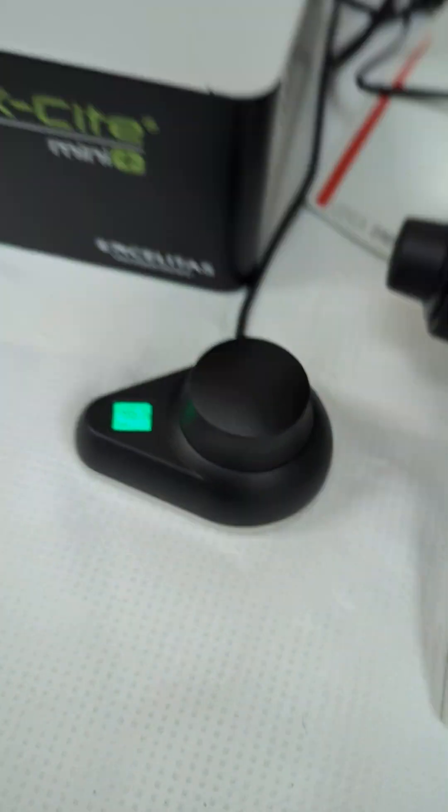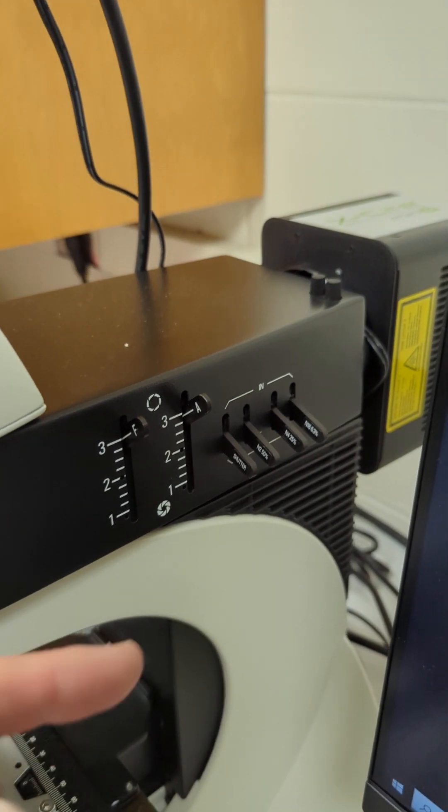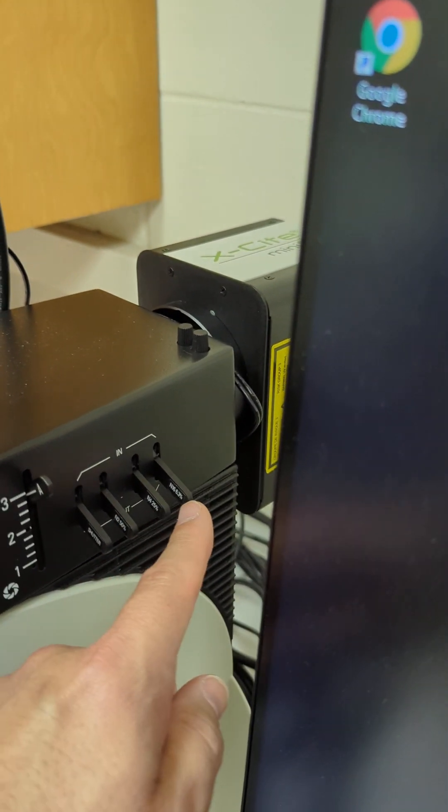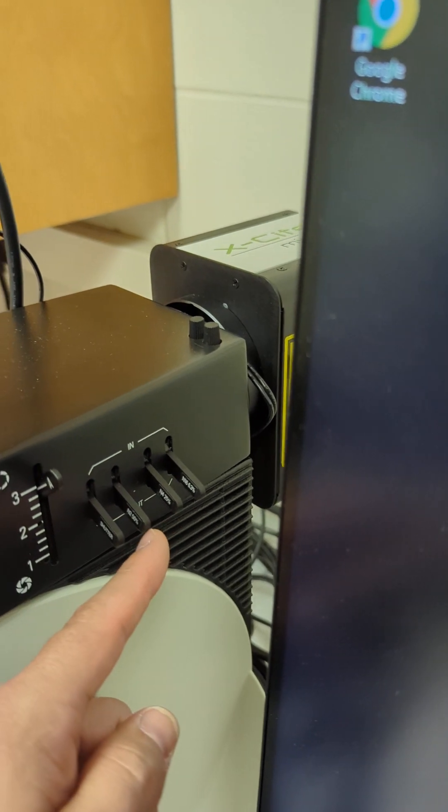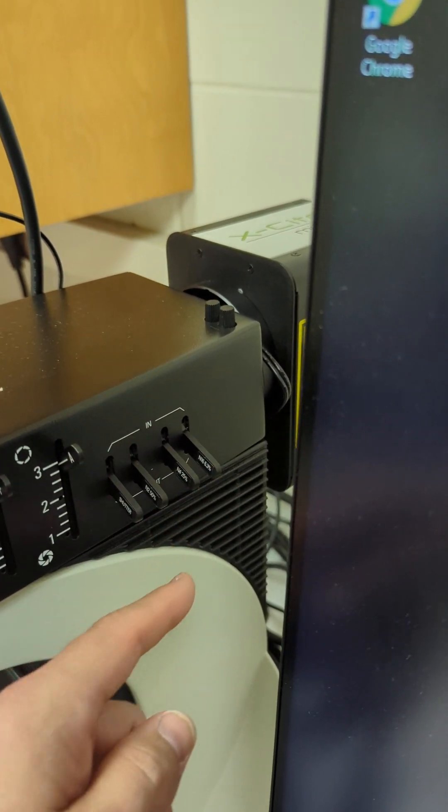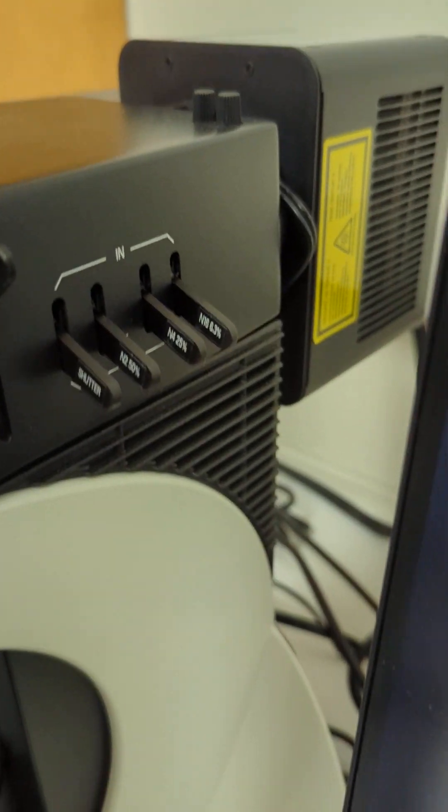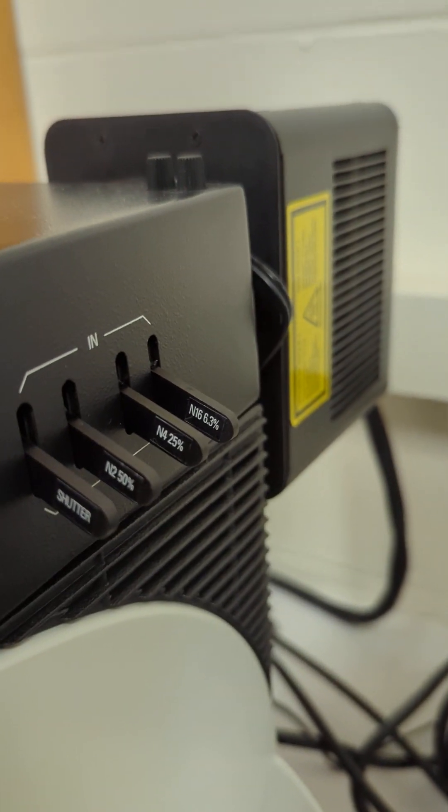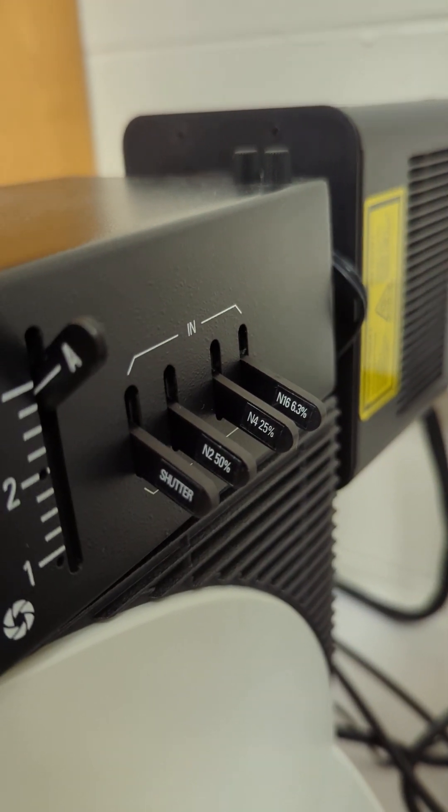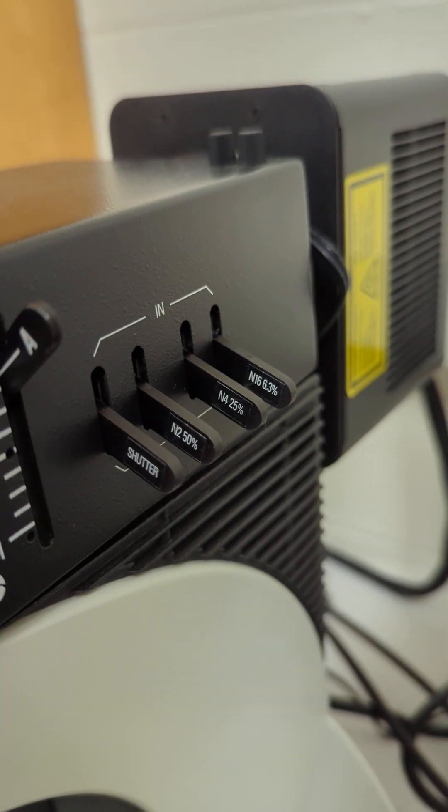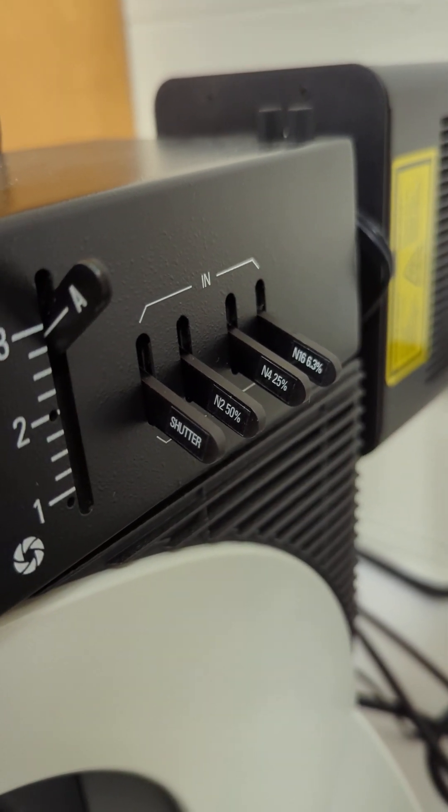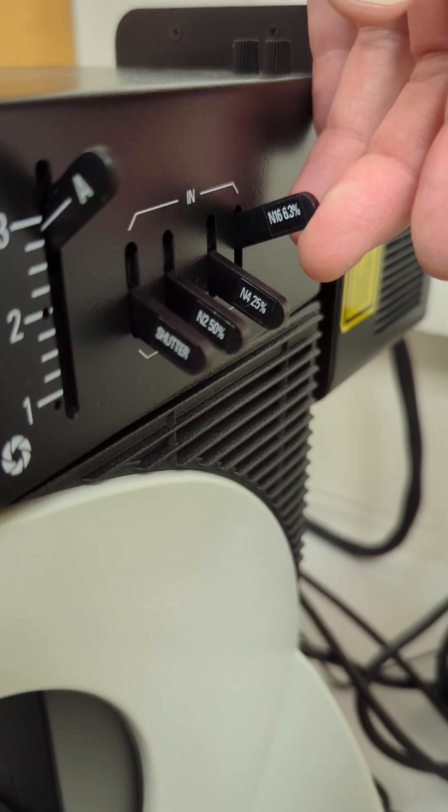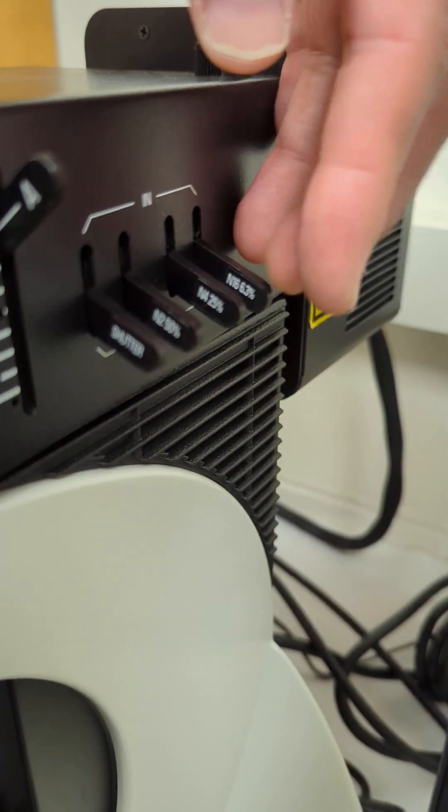What these do on the right side of the top scope: these are neutral density filters, so you can cut the light by however much the percentage says on there. You got 6.3%, 25%, 50%, and you just flip those in, flip them into the path or out.